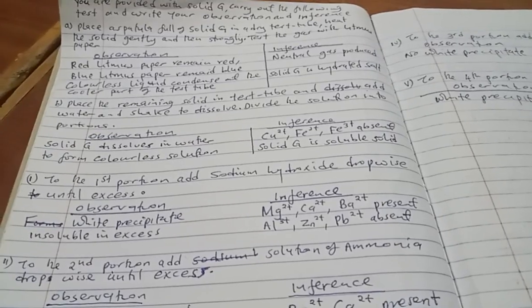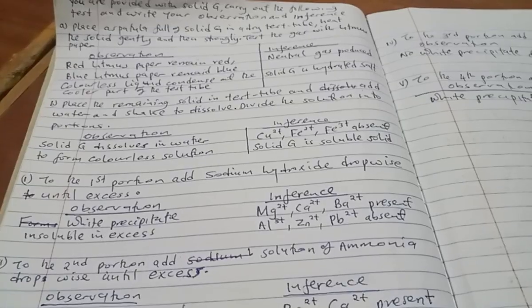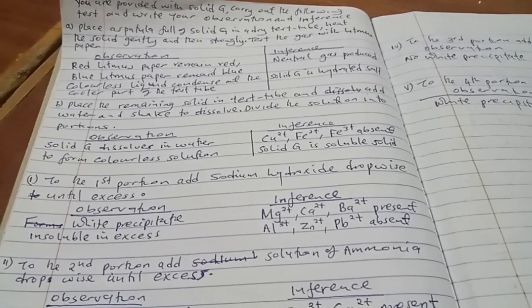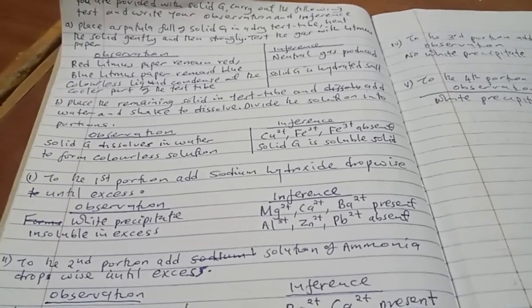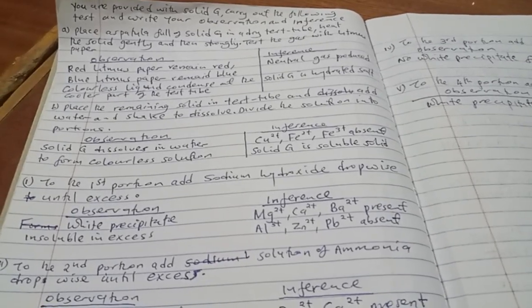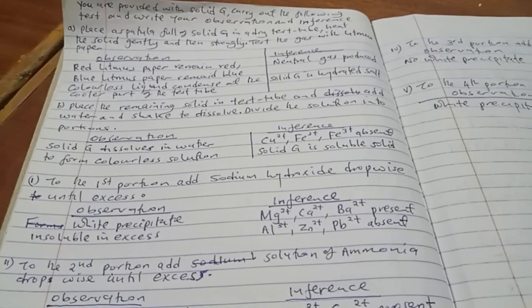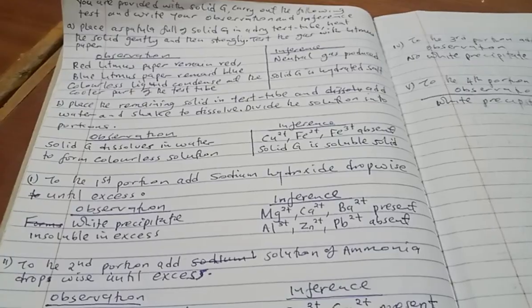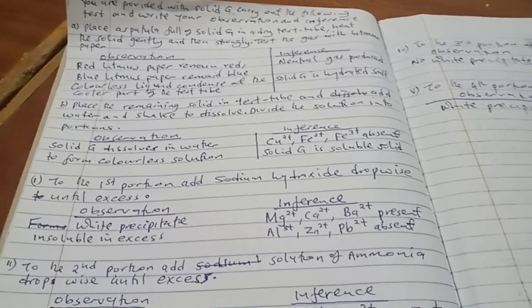If it dissolves to form a colorless solution, then the copper ion, the iron 2 and iron 3 ions are normally absent. Those are the colored ions. They are absent if the solution is colorless. If it is blue, you tell us that it is copper. If it is green, you tell us that it is iron 2. If it is brown, you tell us that it is iron 3. Then again, you need to tell us that solid G is a soluble solid.